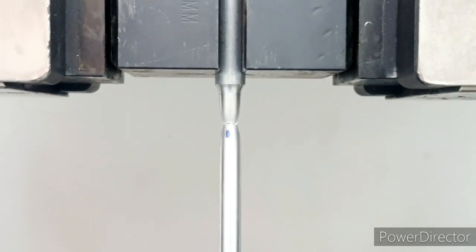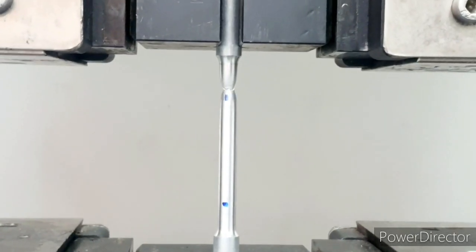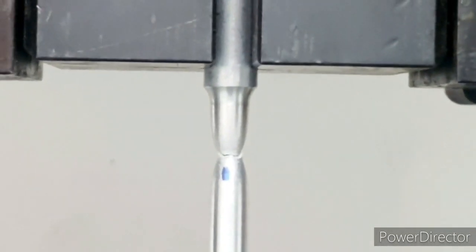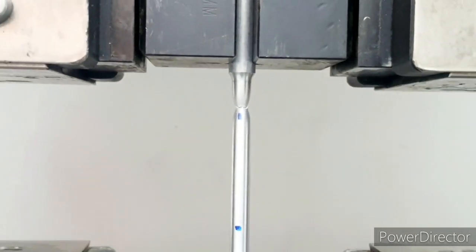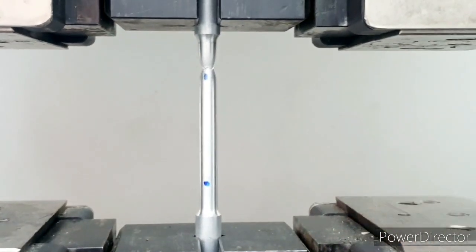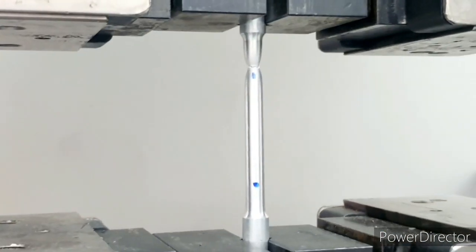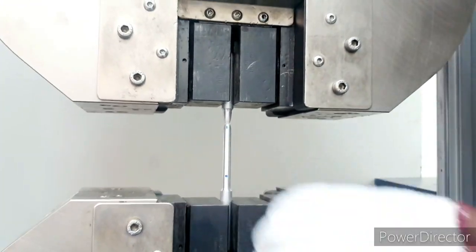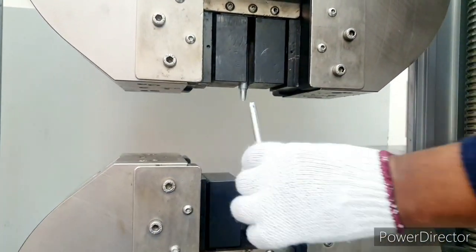Now the test is finished. In this case the breaking of the sample is from the top. We can see it here. This can happen during the test. Ideally we want it in the center, but sometimes it can happen from the top. Now we will unmount the sample pieces.